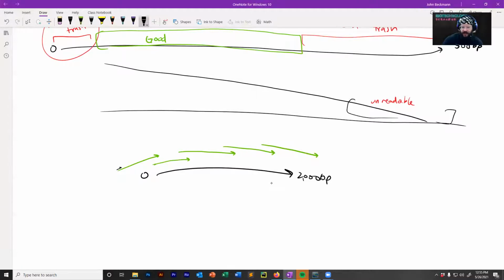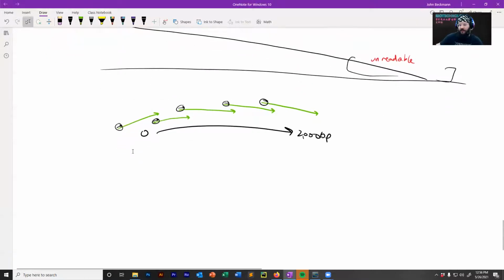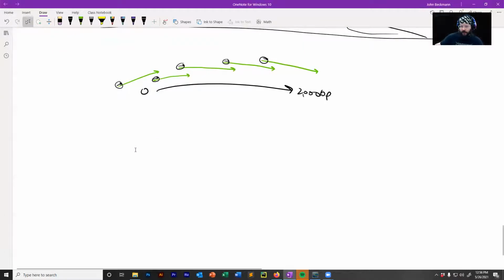So you would have to do a Sanger sequencing reaction with a primer here, and a different Sanger sequencing reaction, same template, but different primer here, and then a different primer here, different primer here, different primer here. Okay. And oftentimes what is also very common, if you are actually using Sanger data for some type of experimental interpretation or some important result, it also is helpful to do forward reads and reverse reads.